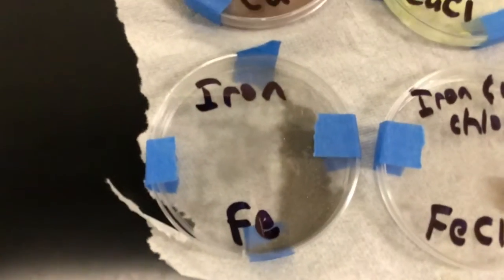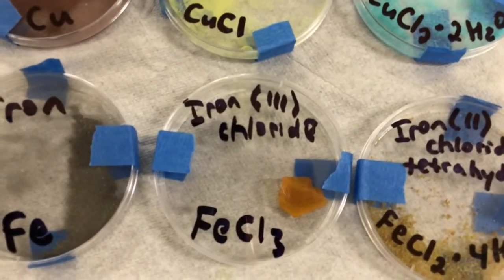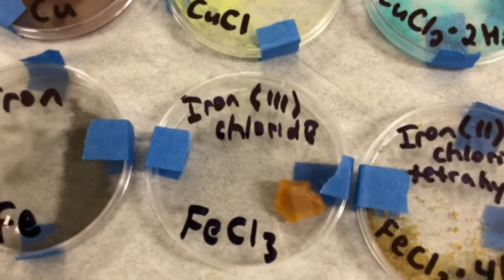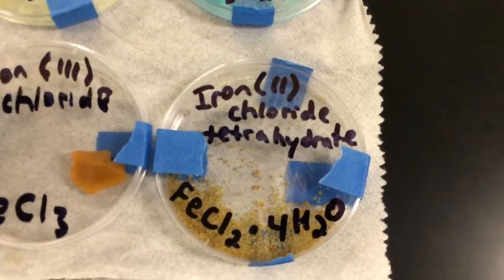This is pure iron, iron 3 chloride, and iron 2 chloride.